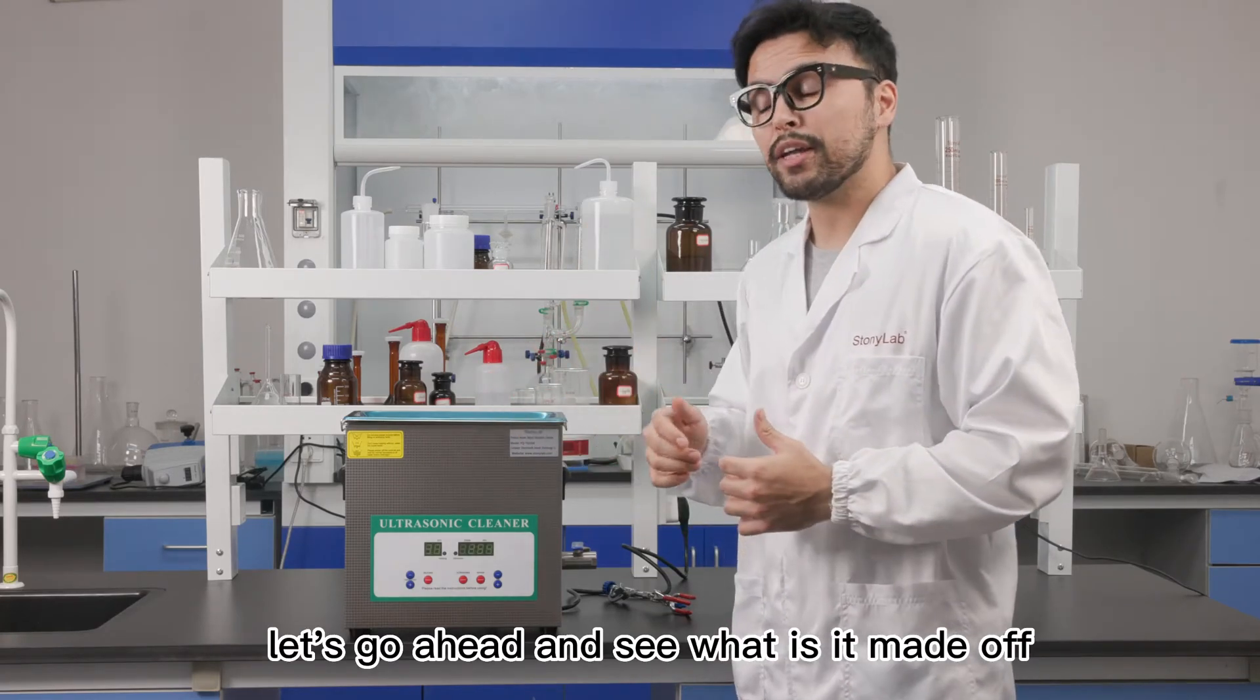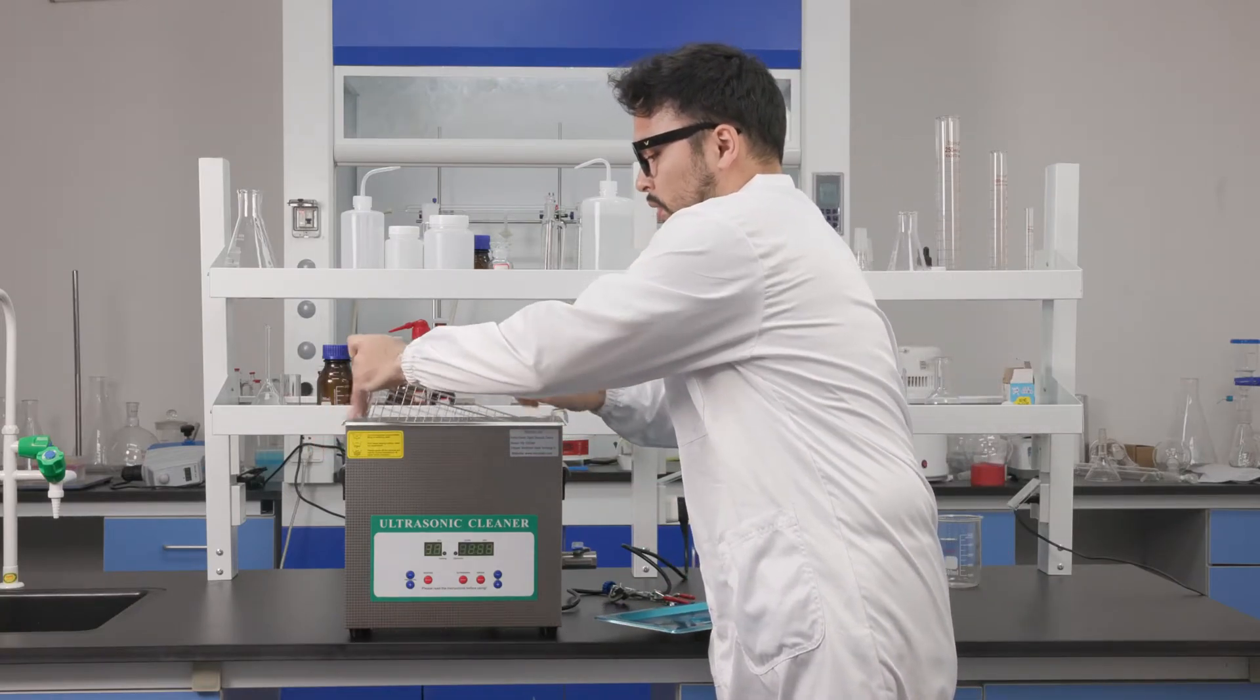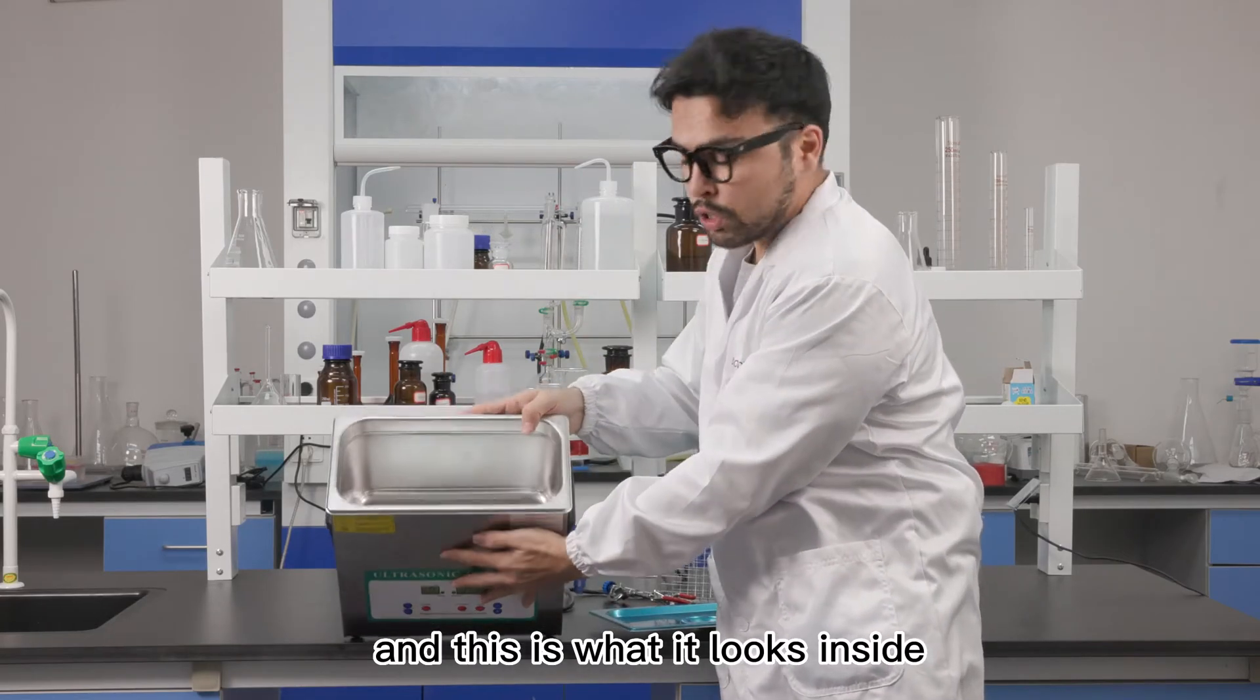Let's go ahead and see what it's made of. So first thing first, we got a basket inside and this is what it looks like inside.